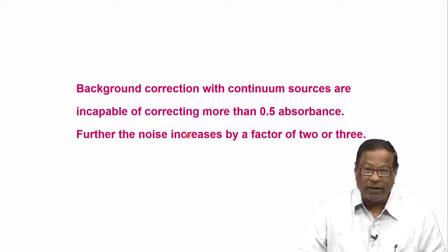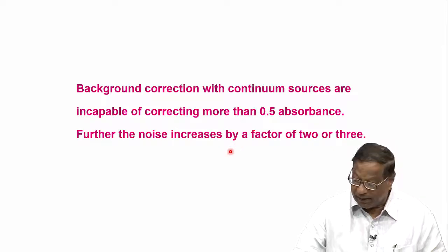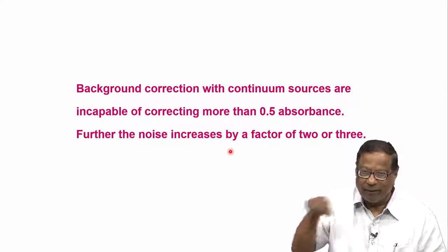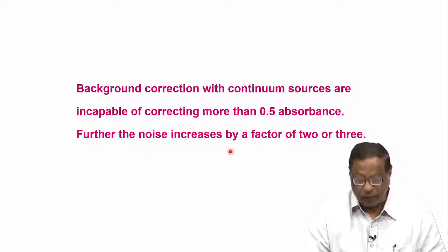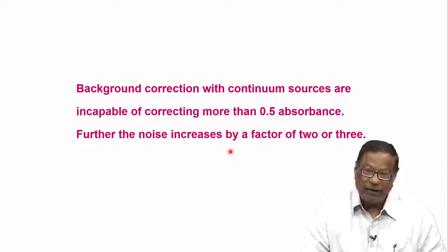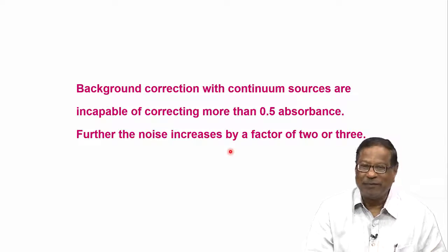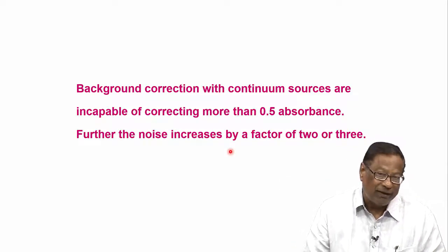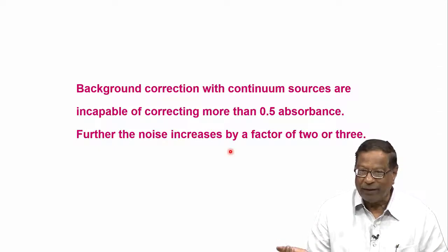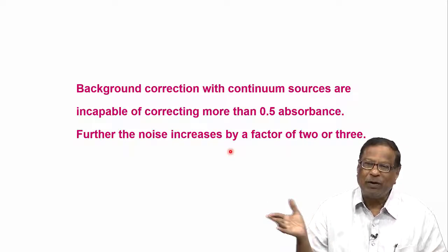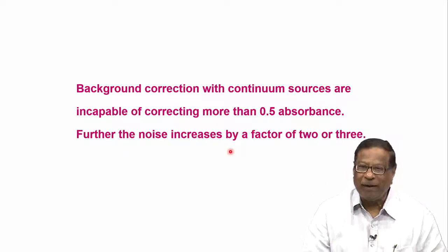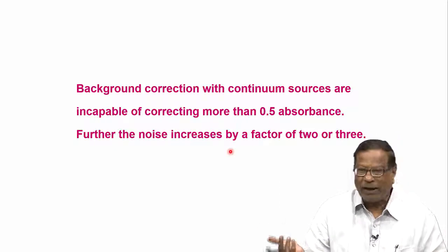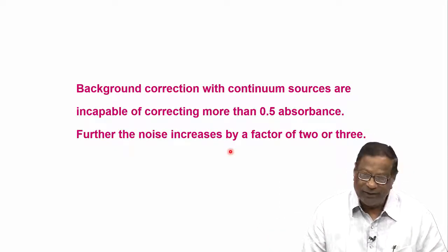If the background absorbance of the blank is more than 0.5, it is a little difficult to correct the background coming from the sample. The noise increases by a factor of 2 or 3, meaning the signal-to-noise ratio decreases. We need the signal-to-noise ratio to increase for good atomic absorption measurements, so we try to keep the background absorption less than 0.5 as far as possible, which is to be subtracted from the hollow cathode lamp signal.